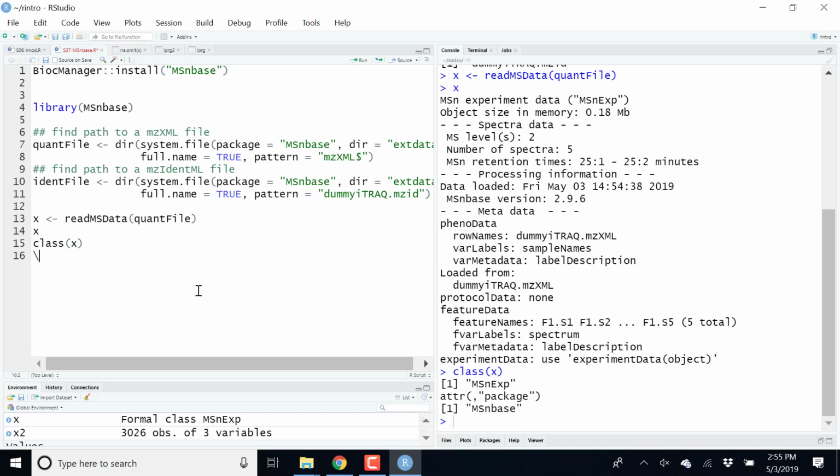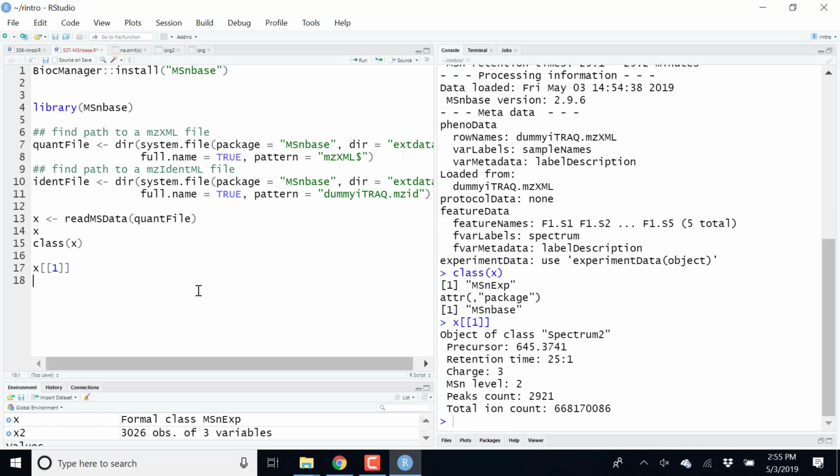And so we have seen that to do some subsetting, we can use the square bracket operator, like this one. We haven't seen lists, and if we had seen lists, we would have seen that in some cases we need to use a double square bracket operator, which is what we need to do here. But if now I say x and use this square bracket operator, the operator to do subsetting, and I say 1, I extract my first spectrum out of this raw data that had length 5 spectra, and now we extract the first spectrum.